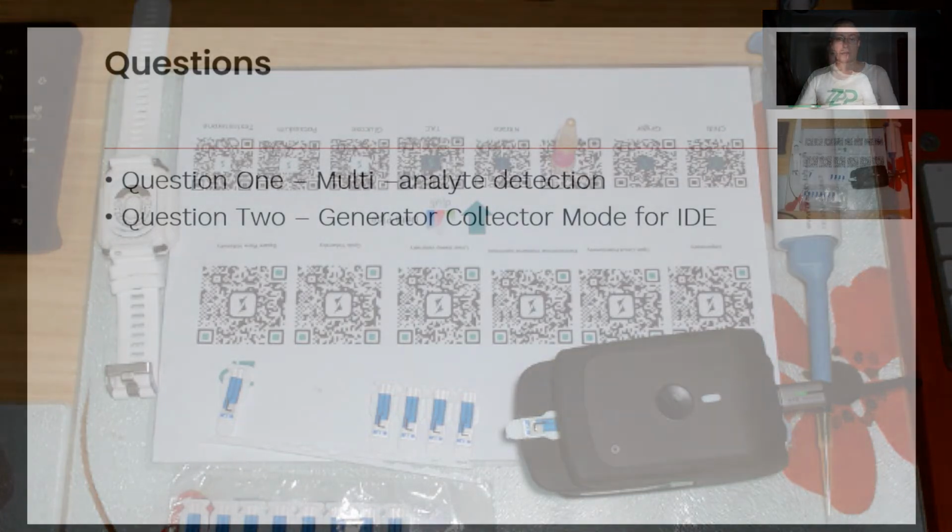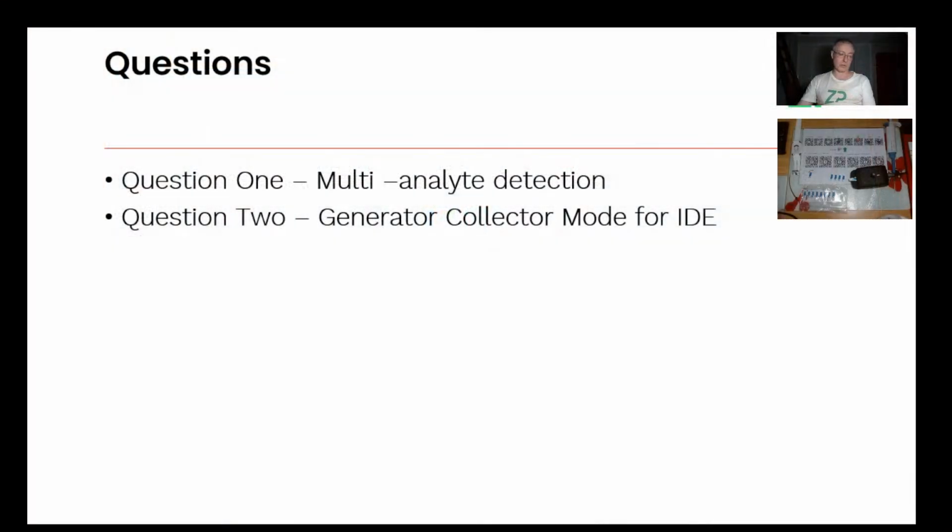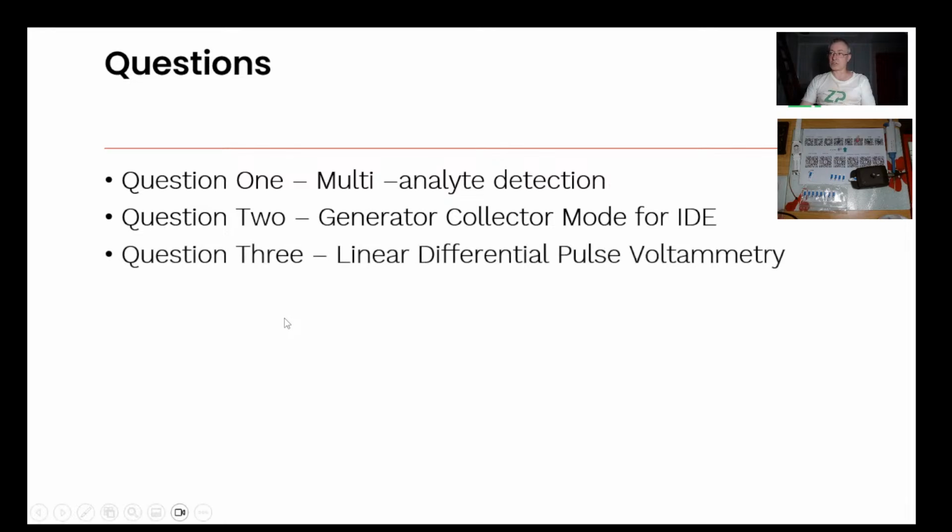Anyway, they've got what's called an Anapot EIS, and they want to know about interdigitated electrodes running in a generator collector mode. And I will talk about that. I've got quite a few slides on that. So that's question number 2.